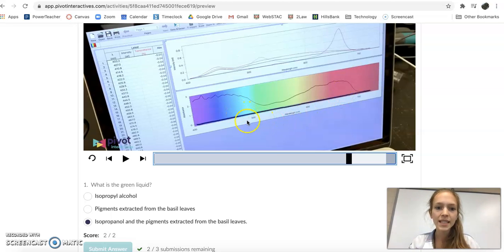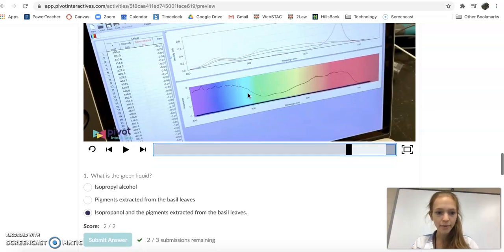So we can say, this is my favorite color, guys. This nice teal has about a 500 nanometer wavelength, okay? And that's how I'm going to identify the color of light. I'm just going to say light at 500 nanometers absorbs at this level, at this intensity, okay? So that's how we're looking at this graph.